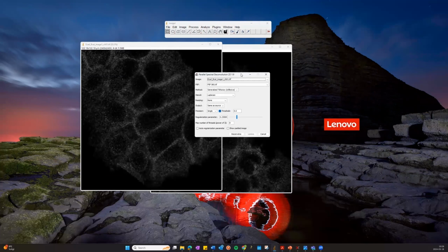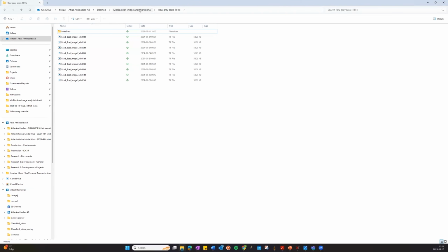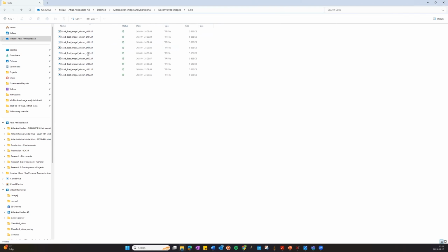And then you will do exactly the same thing, but all you do is change the image to image 2, and you do deconvolve again, and save that one. And then you do image 3, and deconvolve again against the same PSF. So then you end up with 3 deconvolved channel 01 images in the end, as you can see, 1, 2, 3 for the 3 different image sets.